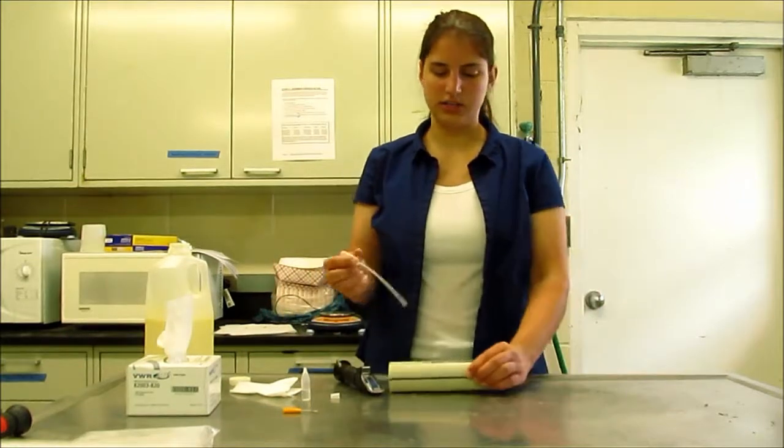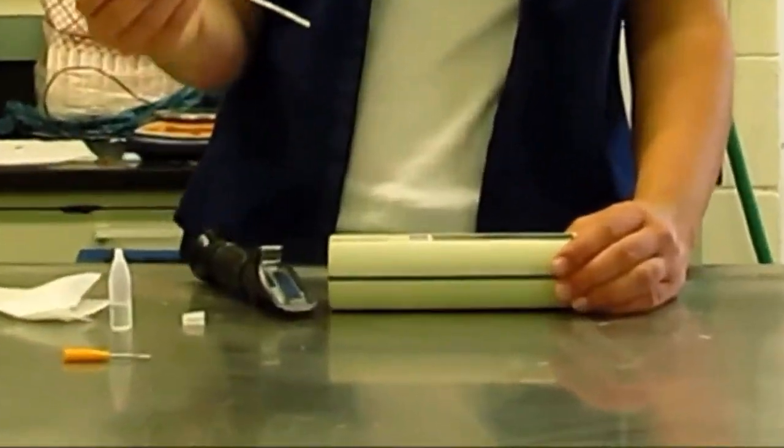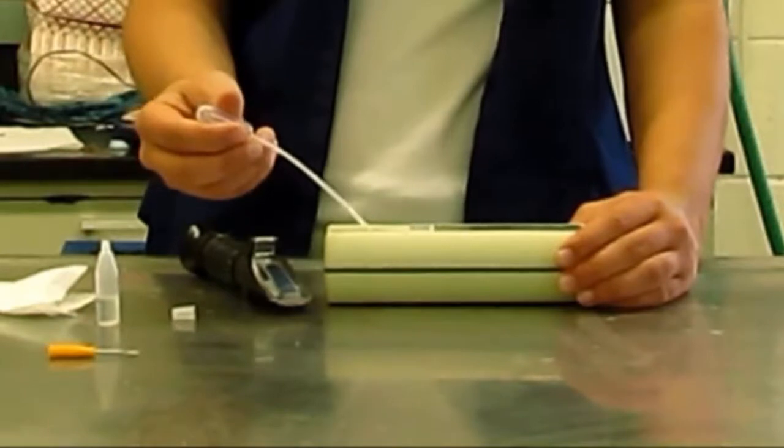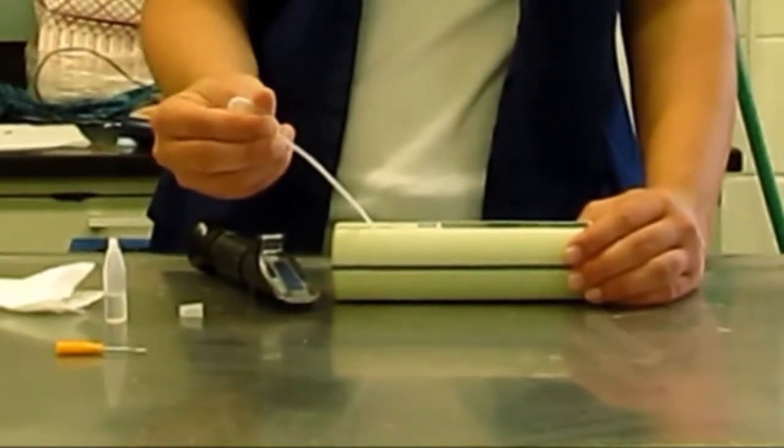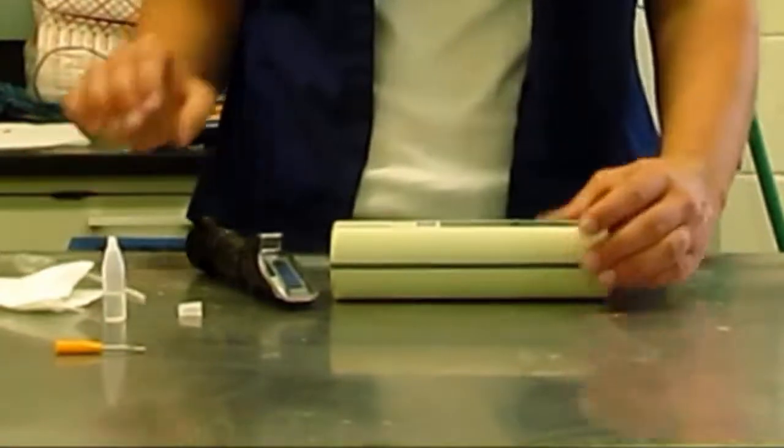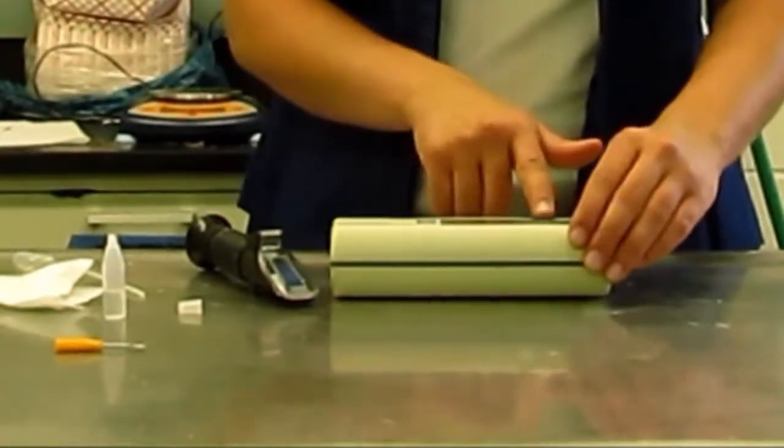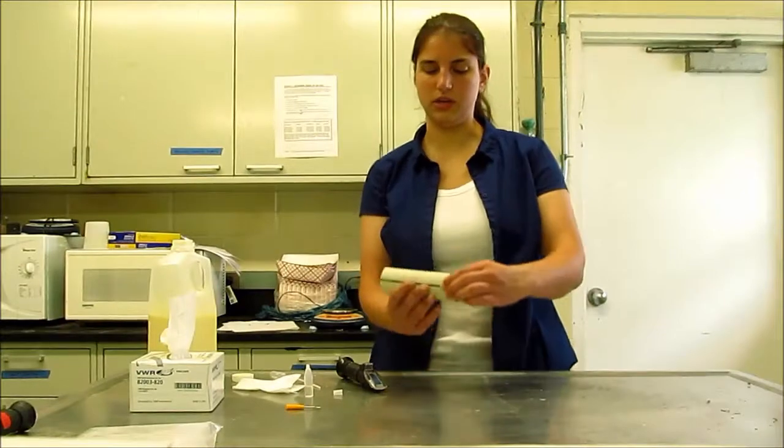Similarly, on the digital refractometer, the same type of thing, it's just a little bit more precise. You're going to put a couple of drops on the surface of the refractometer, just so it's covered. It only takes one or two drops. And then you simply press the measure button, and it'll give you a reading.